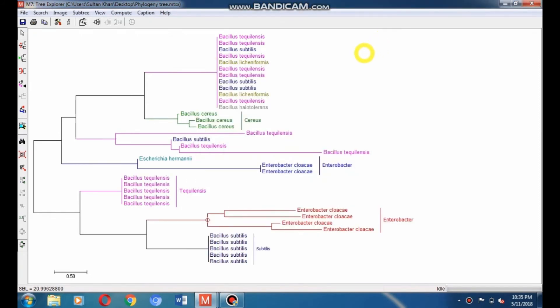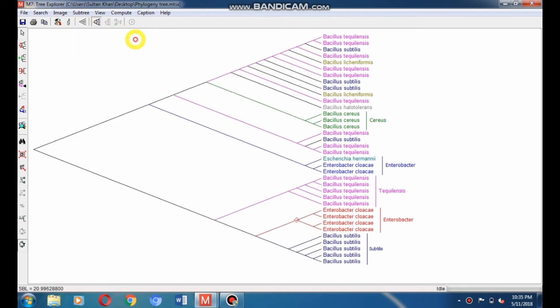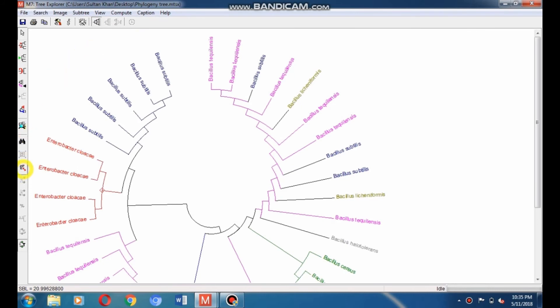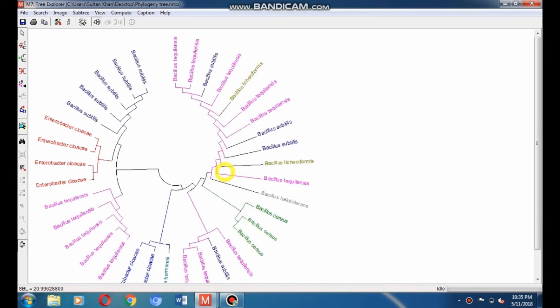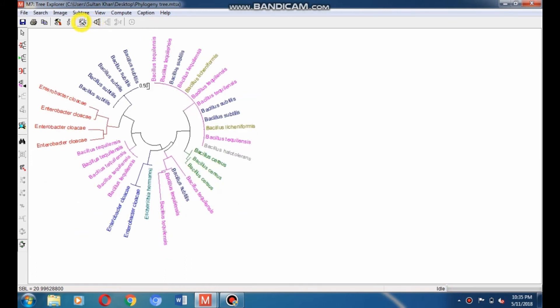Now a colorful phylogeny tree is developed. Go to Display Only Topology and change the tree style. Go to Tree Style and select straight tree. Select Circle to make a circular tree. You can resize the phylogeny tree by single-clicking on the resize tool and using left-click. You can also make the circular tree in compressed form. Click on Display Only Topology to make your circular phylogeny tree compressed. You can see the bootstrap value in the middle of the circular tree.